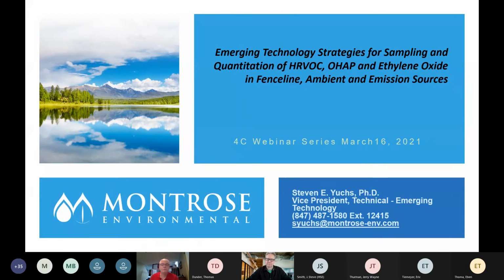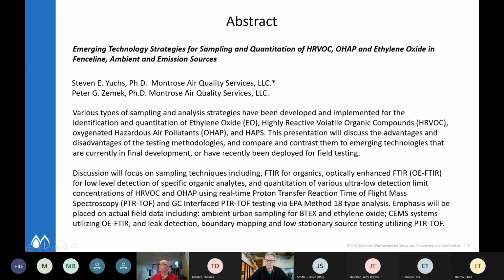Thanks everyone for stopping by. We're going to talk a little bit today about some of the emerging technology work that we've been working on, and we're going to focus a little bit on HRVOC, OHAP, regular HAP, and of course ethylene oxide that everyone loves. And we're going to look at a little bit of fence line, ambient, and some stationary emission sources as well.